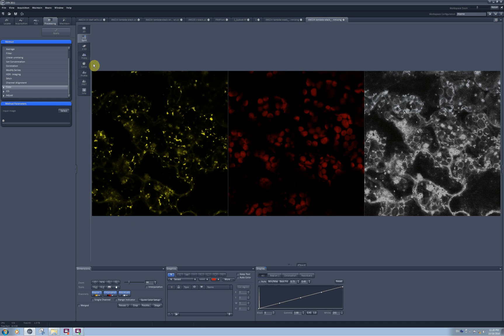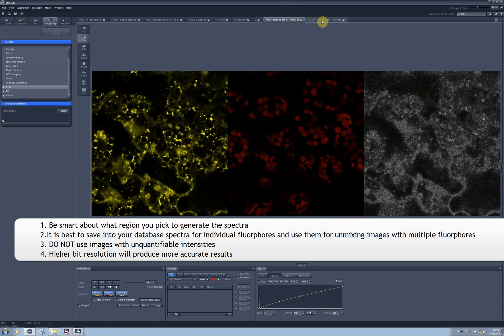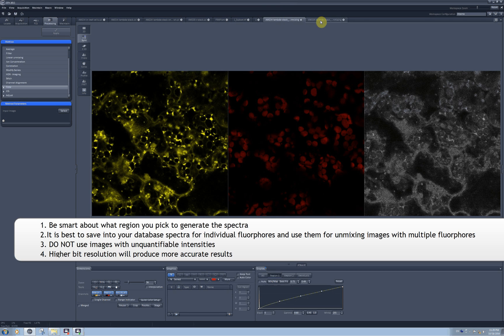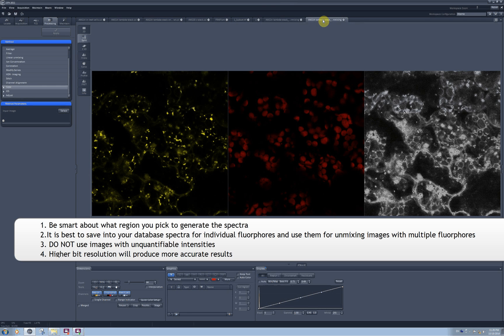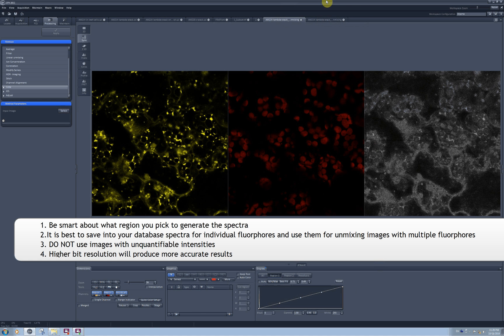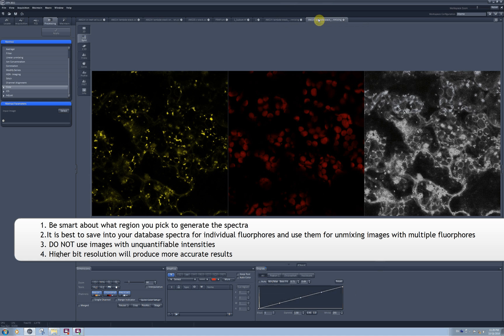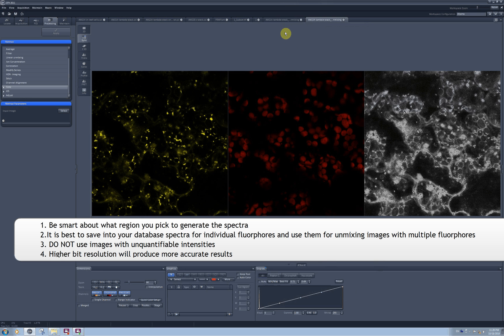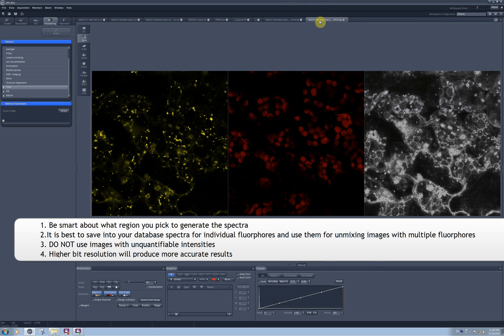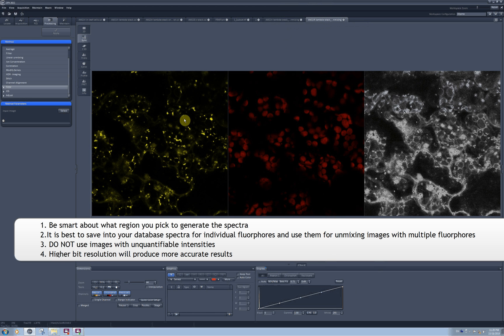And this is my unmixed image, and it looks quite different from the selection made by the automatic component extraction. While the chlorophyll looks very similar, there is more signal removed from the YFP channel.